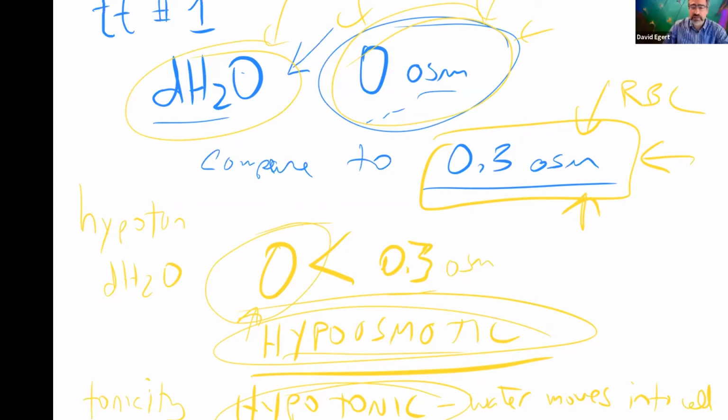No, that's not right, because we're going to see hypotonic solutions with penetrating solutes in today's lab, like urea. So hypotonic just means the water moves into the cell when you put the cell in the solution. And our solutions that have penetrating solutes are going to be hypotonic. So, yeah. All right, test tube 1. Next we go to test tube 2.